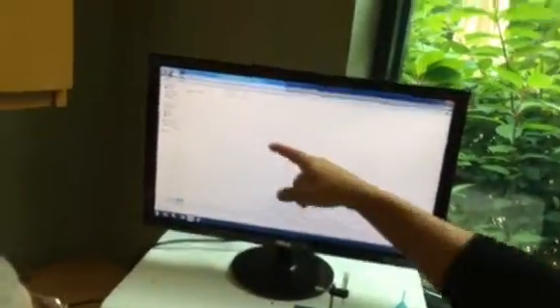And now we need to save it. Right now we're in the 4x folder, it looks like. So we should navigate back up. Just click on the high tech right there. Now let's create a new folder. And this one's going to be 10x, 100 micron.